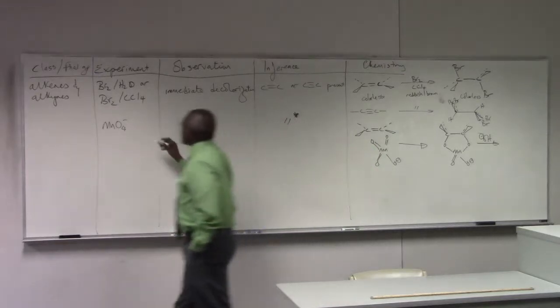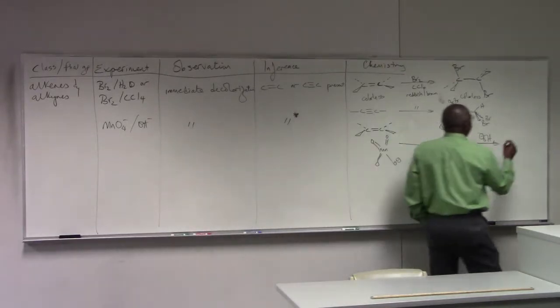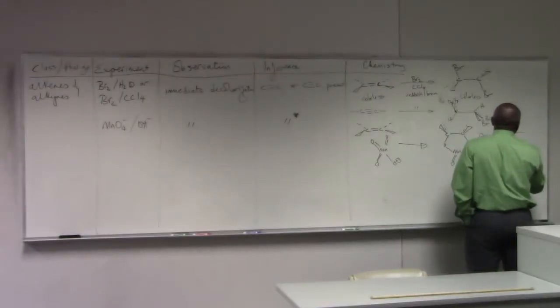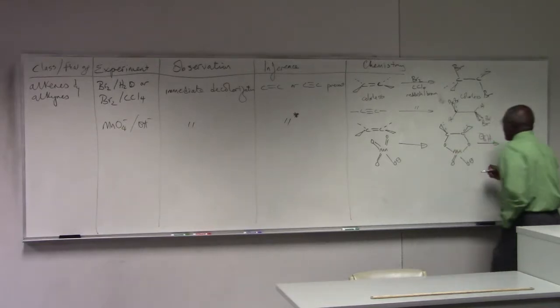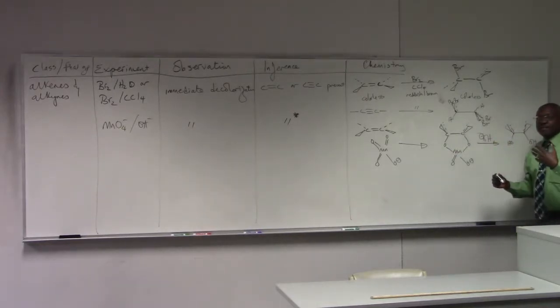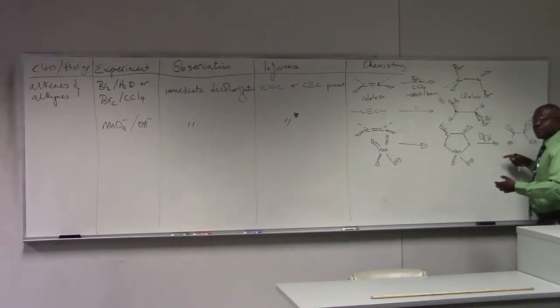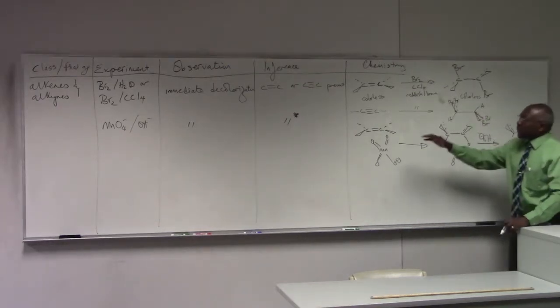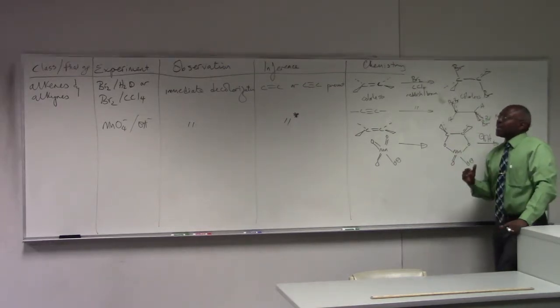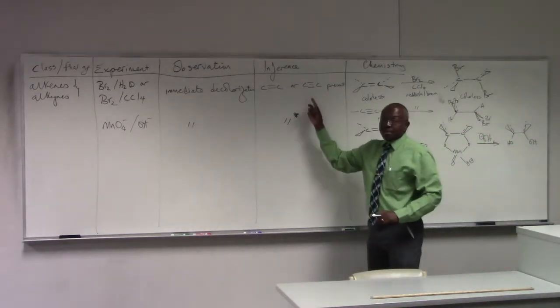So this is basic permanganate. That gives rise to the diol, the syn addition of the diol. But you go from the purple permanganate to the colorless products, and all of this you should have covered in Organic 1. So that decolorization is indicative of the presence of carbon-carbon unsaturation.